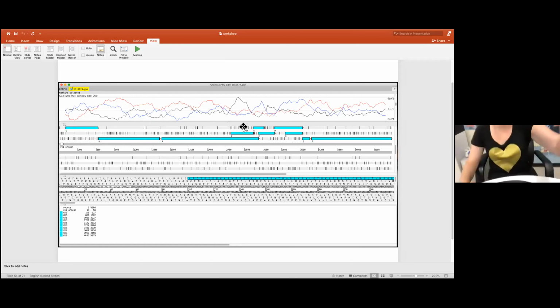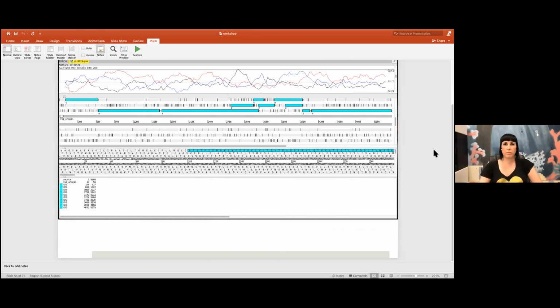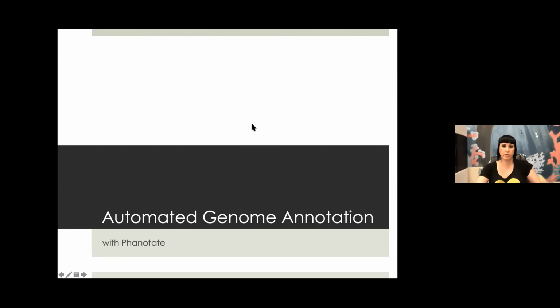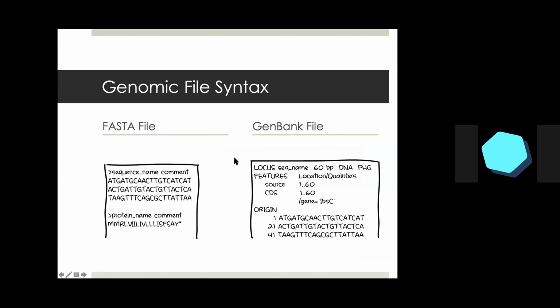And so I don't really have all that much to talk about because I had lessons that aren't apparently going to work. So I think I might have some stuff. Let's see, why are you not? Let me see. I think I have a little bit on how to run PHANOTATE, but not much. Is it still sharing? Yeah. Okay, so yeah, so here is that.